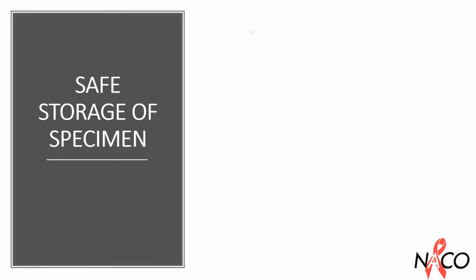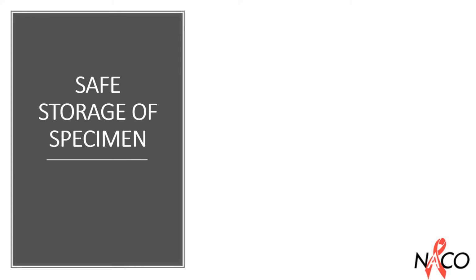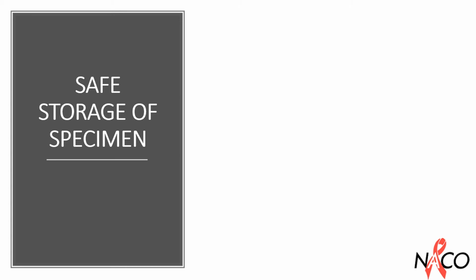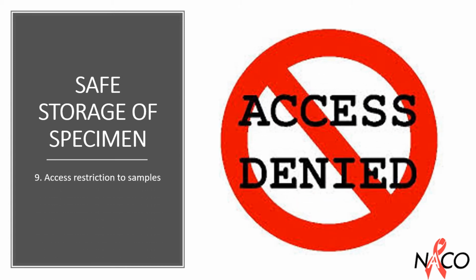Storage verification should be done with retained sample verification and, if possible, statistical analysis. Samples that undergo freeze-thaw cycles should be monitored adequately. Only authorized personnel should have access to these retained samples. Access restriction to samples is mandatory.